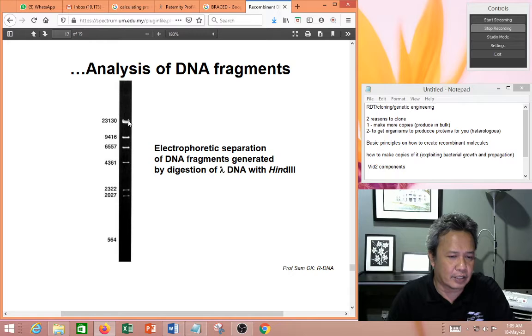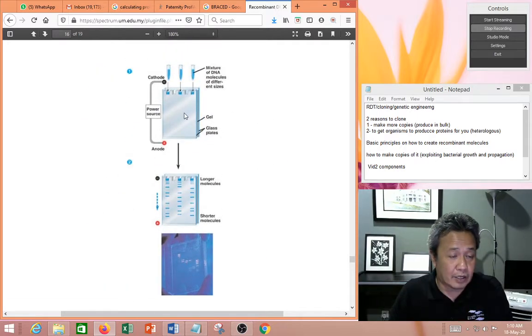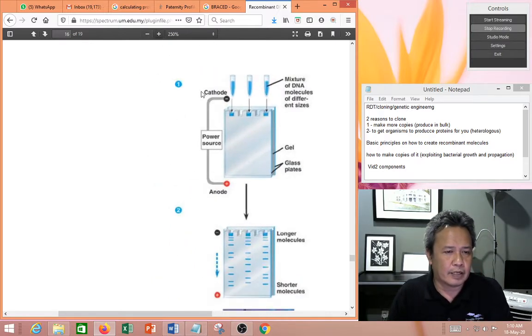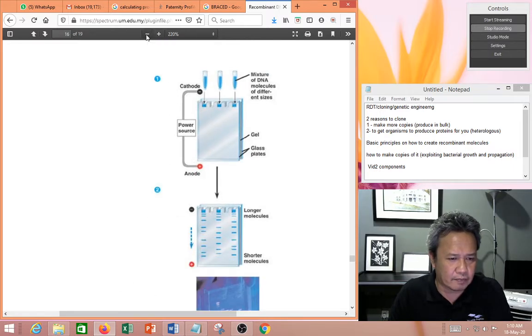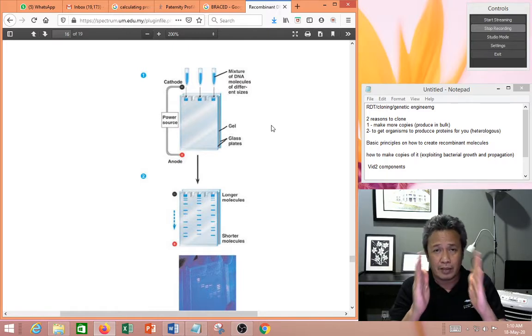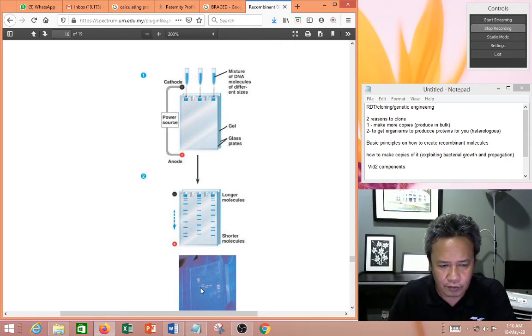All right, so this is electrophoresis. These are your gels again. I'll just enlarge this a bit. You put your samples. Now, this is a vertical system. Normally, your gels can be horizontal on a slab, or sometimes if you do sequencing, you'll have vertical systems. The principle is the same. You run it, and then you view the fragments.